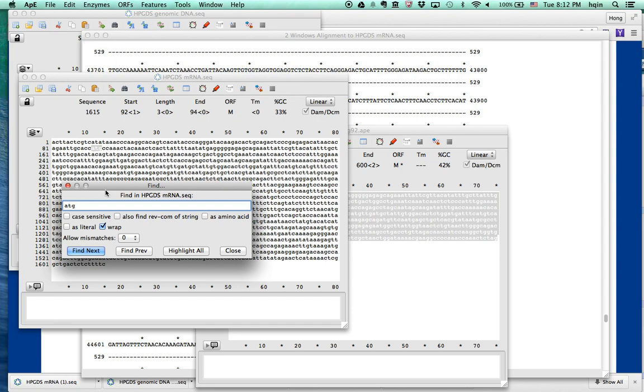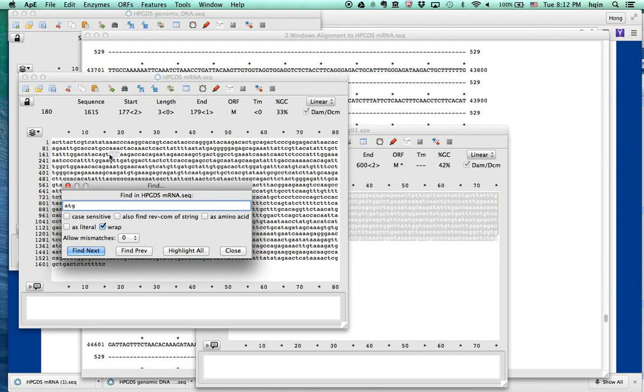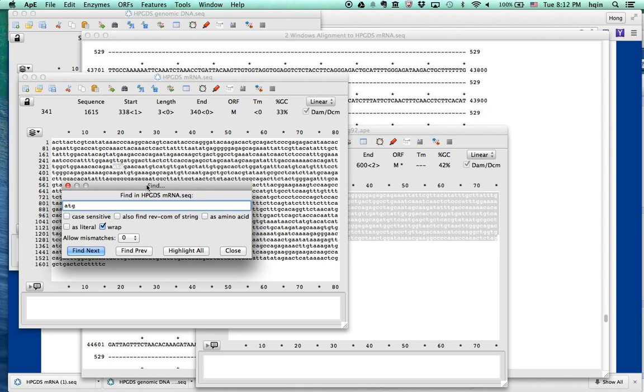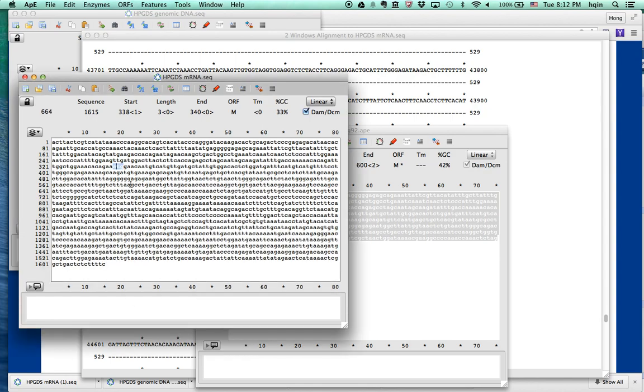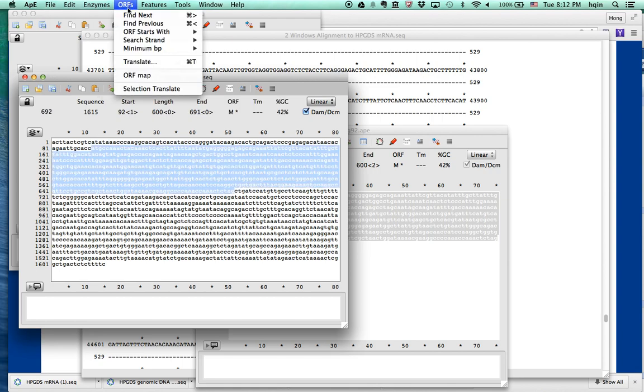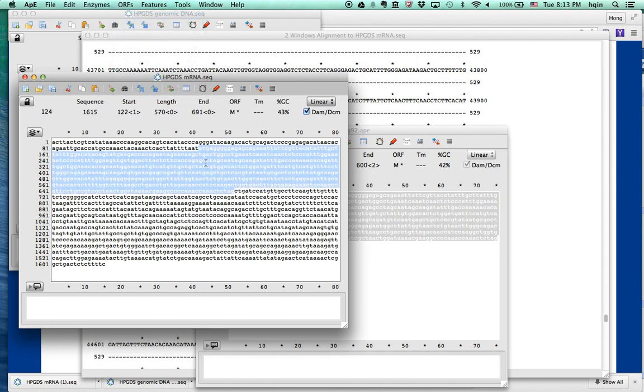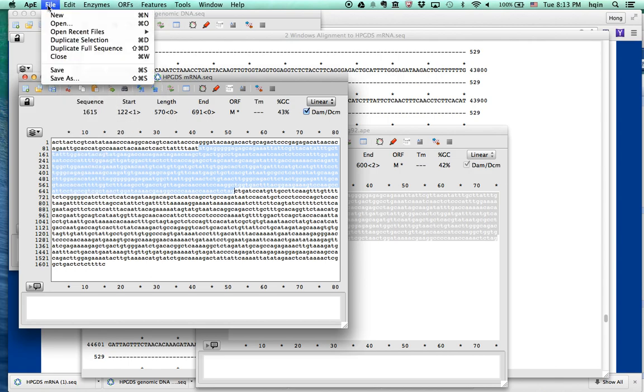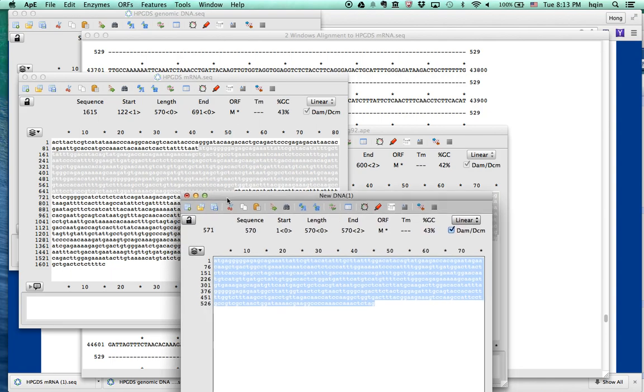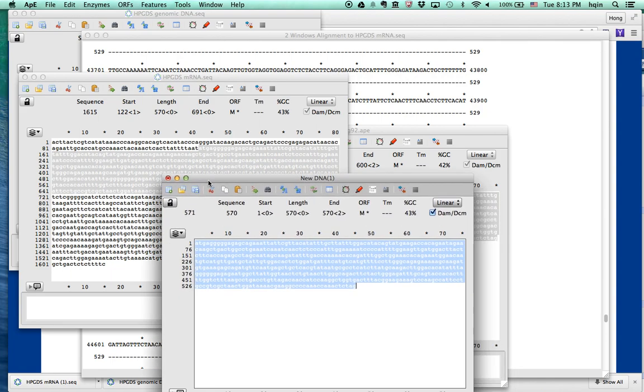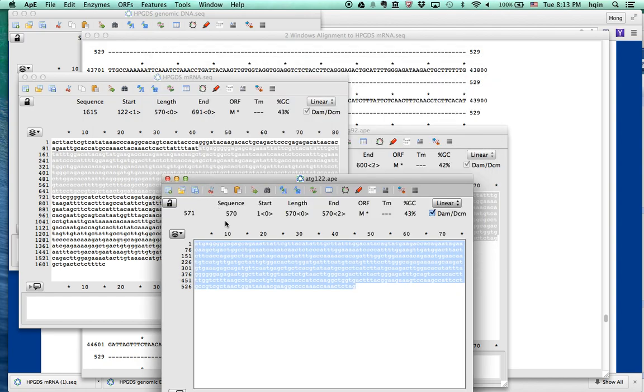If we look next one, oh, there's another ATG here. There's another ATG. It's quite a lot of ATG. Let's try again. That's the first one. Find next. That's the next ATG. Again. Copy. New. And this ATG, where does this one start? Start at 122. ATG 122 sequences.